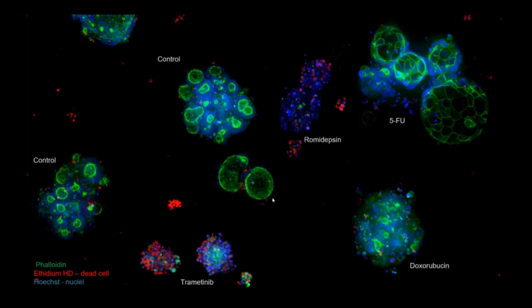Commonly used markers will inform you on the DNA content. Phalloidin, which as you can see over here in green, shows cytoskeletal structure. You can also add calcein AM to indicate viability. And in this case here, I used ethidium homodimer, which is a marker for dead cells. Depending on what you're looking for and how you design your assay, you can also use specific antibodies.